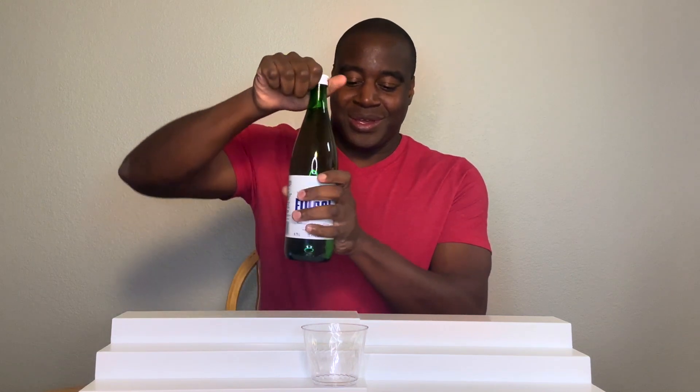Hey, what's going on? I'm LaPrentice DeMond, and in this video, we're going to do a quick pH test on Fugie's spring water. Alright, so let's get this poured out.